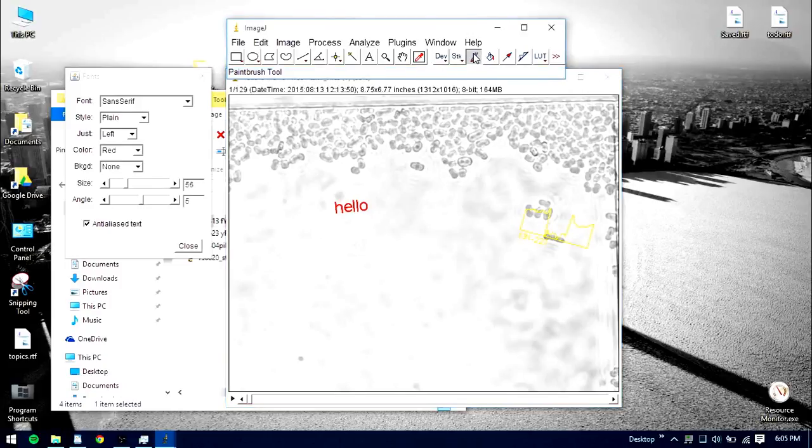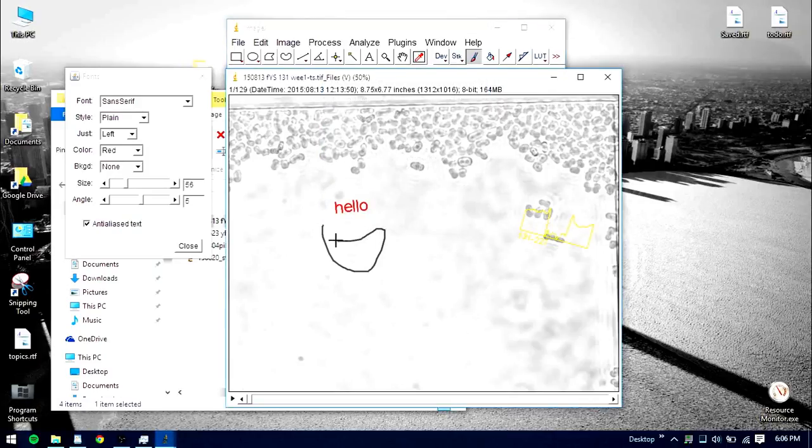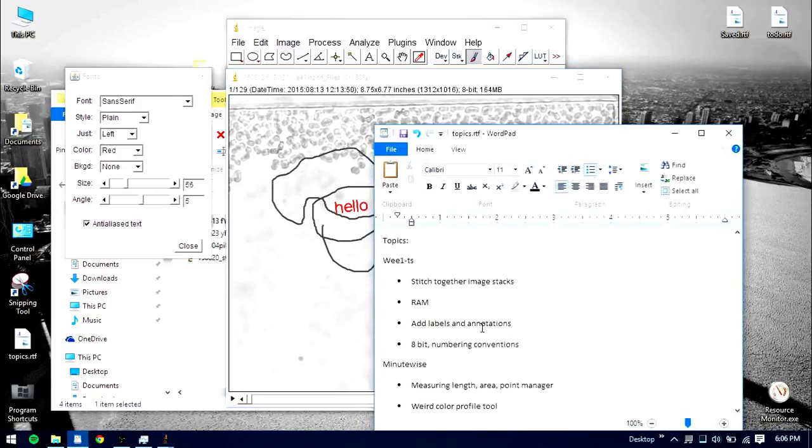And for contrast, I'll get you this paintbrush tool over here, which is set to the color red, and doing the exact same thing but actually modifying the image that we have. The computer interprets it as having the same intensity as what we think of as red. The only difference is the annotation we overlaid isn't actually part of the image, so it doesn't change any of the image data.